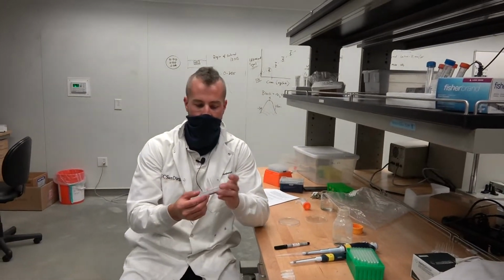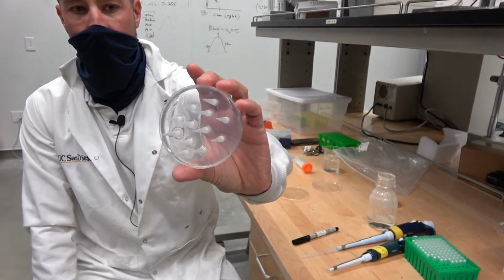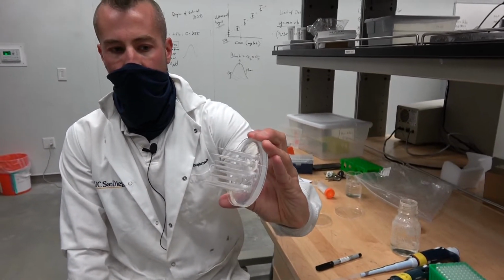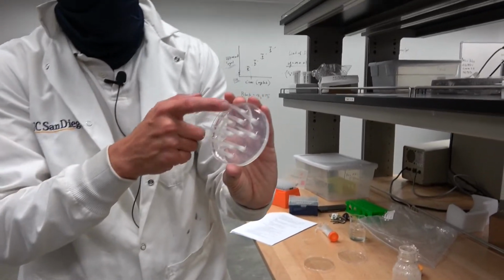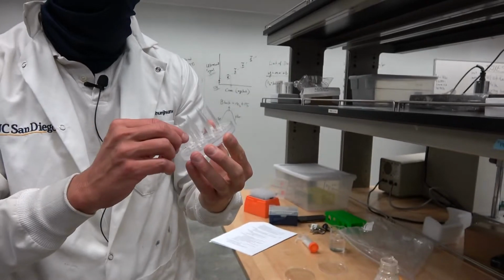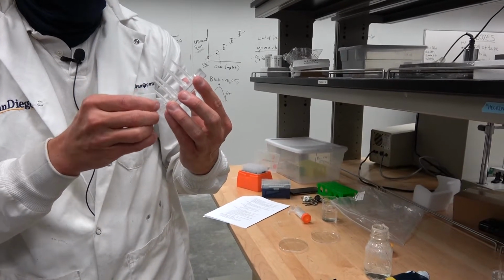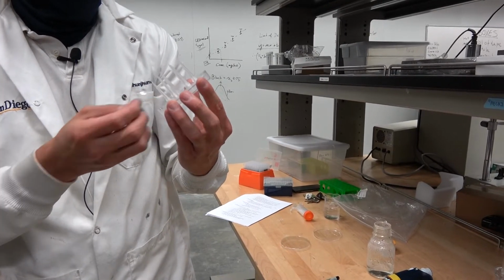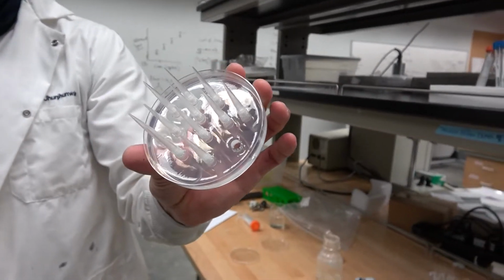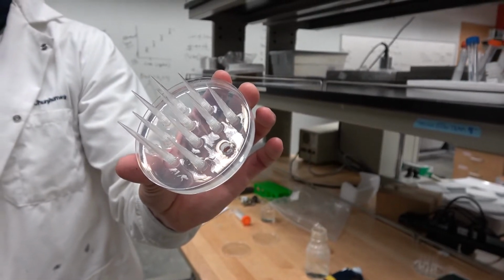So this is after the sample has now cooled, right? It's so hard and solid that it's holding these pipette tips in vertically. I don't know how well you can appreciate it, but it kind of feels like a gummy bear. And so what happens when I remove that pipette tip is I'm left with a little hole. And that's where my sample's going to go.